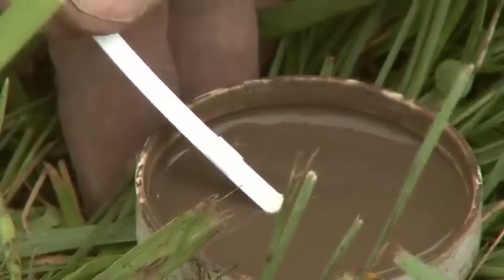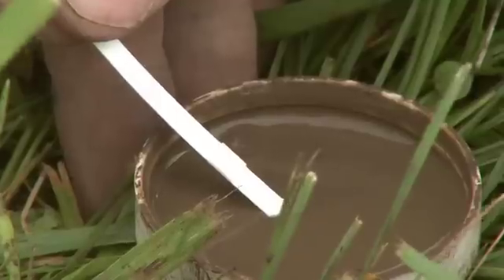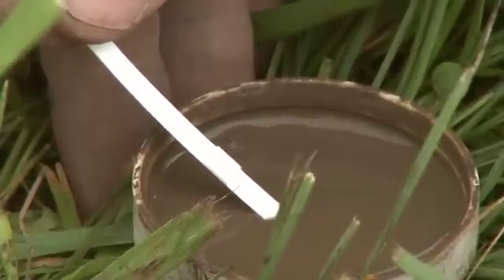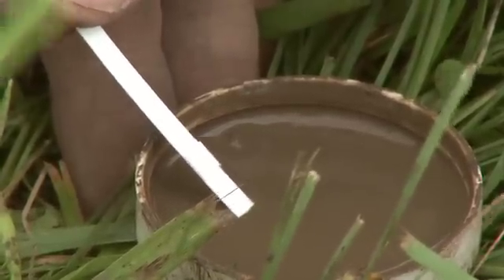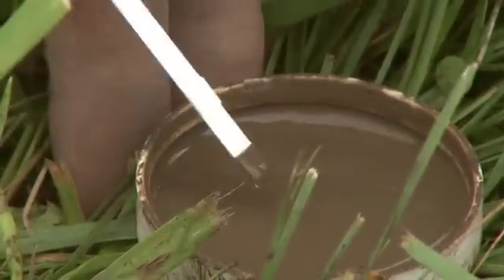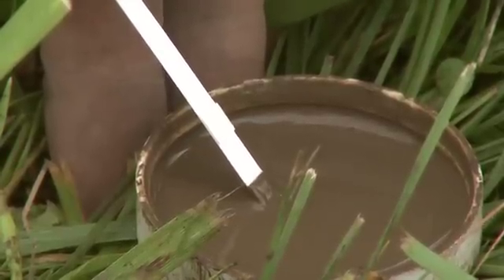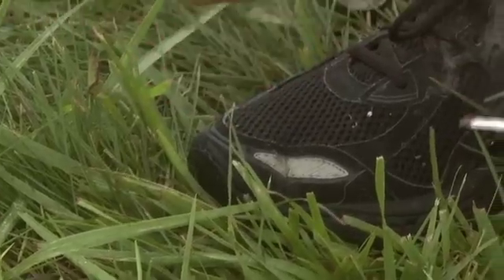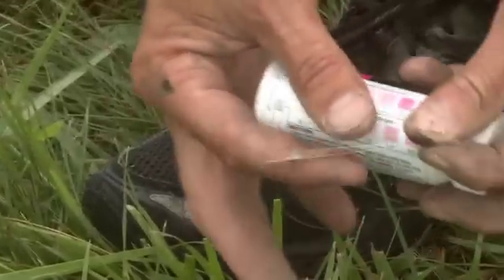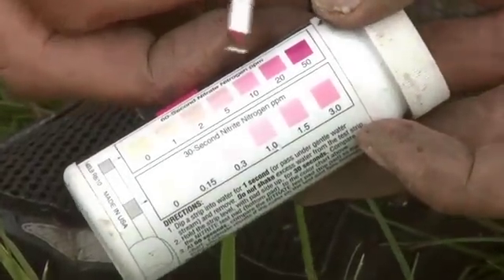To make this easier, it's important to rest your hand on the table if you're doing this in the classroom, or on the ground. We're going to go ahead and compare it to the test strip, and we did nitrate, the first one.